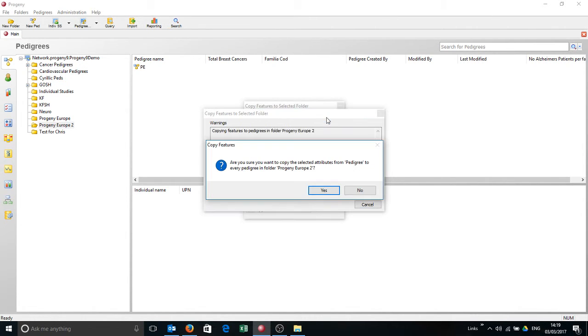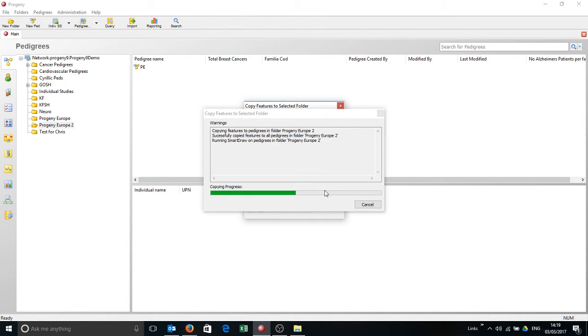Okay, so click OK. And it's going to ask me the question, are you sure? Because obviously any formats in there will be deleted. I'm just going to say yes because I have none. And it says, do I want to run it? And I will do again.